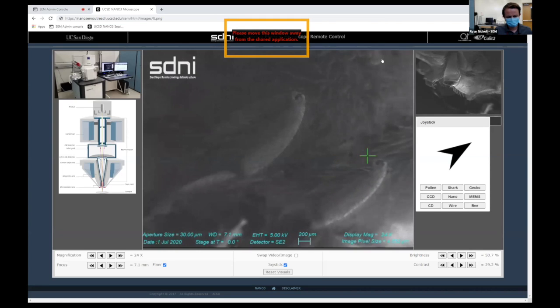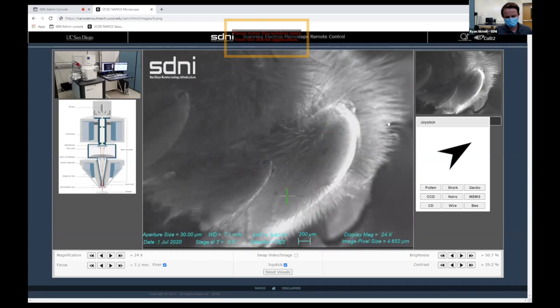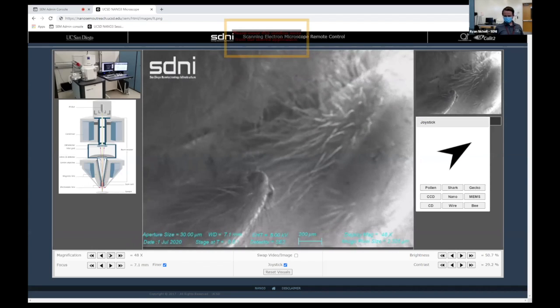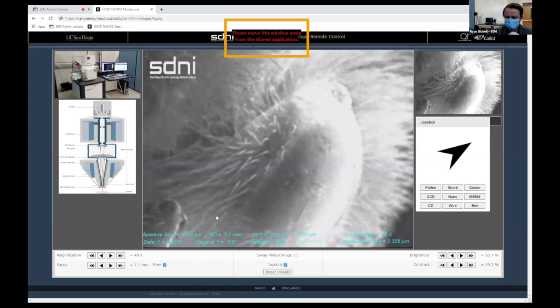If they're heavier. I think this is the eye. I just wanted to point out, I think this is the eye here if you're looking for the eye. If you zoom in here and try to focus, you'll find it. Sorry, Angela. No worries. So if it's darker, it will typically be something that's a heavier metal or heavier atomic element. Other way around. I can add more. Sorry. Yes, I can add more technical detail if you want.